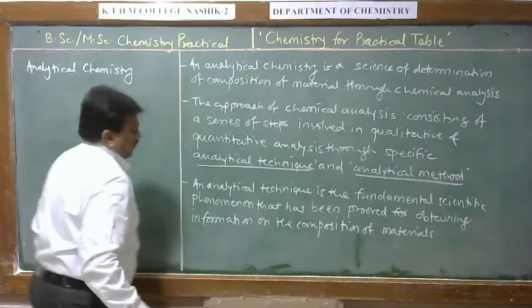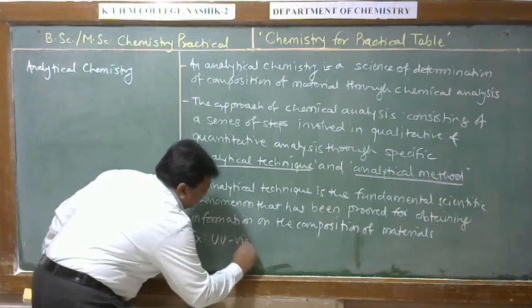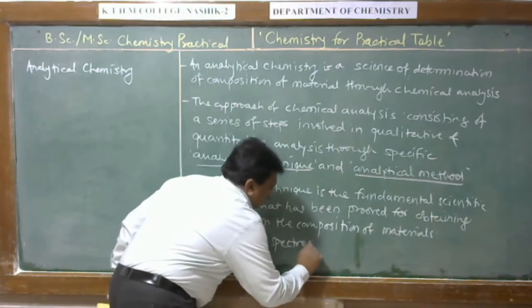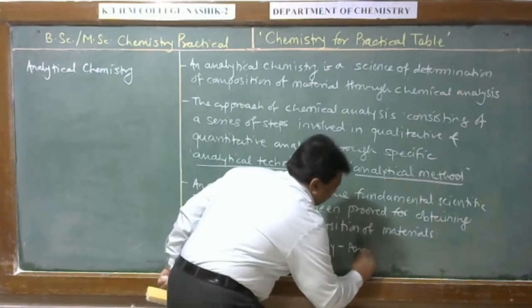For example, UV visible, ultraviolet visible spectroscopy is an analytical technique.